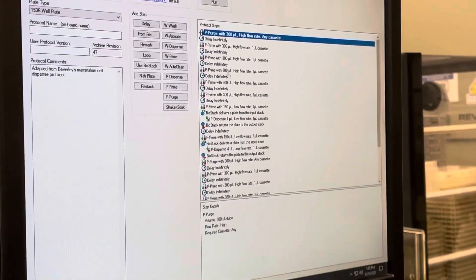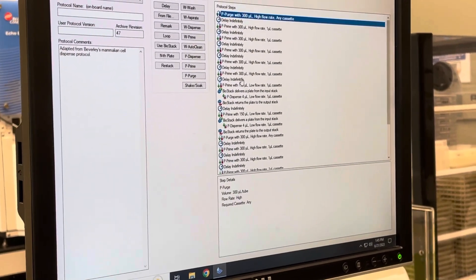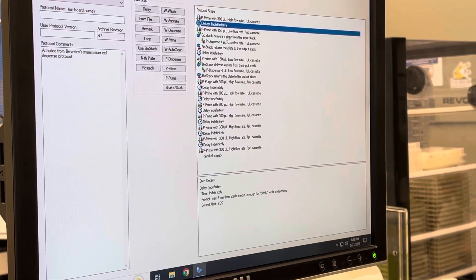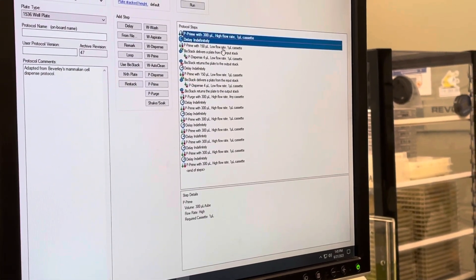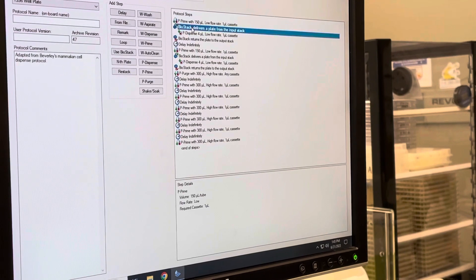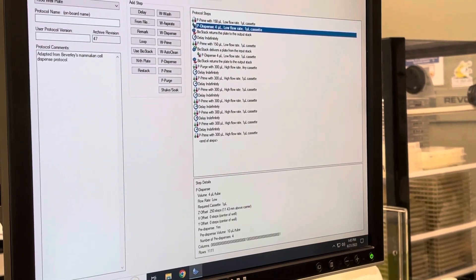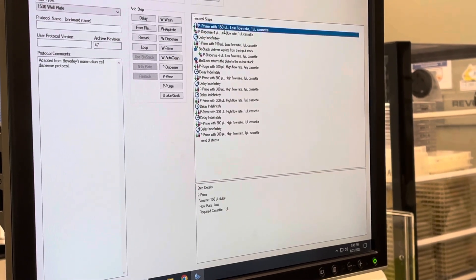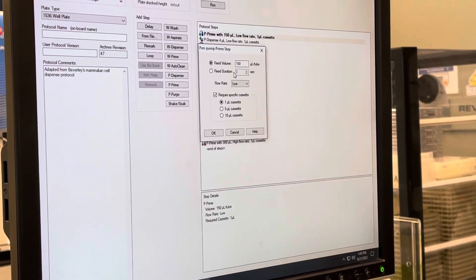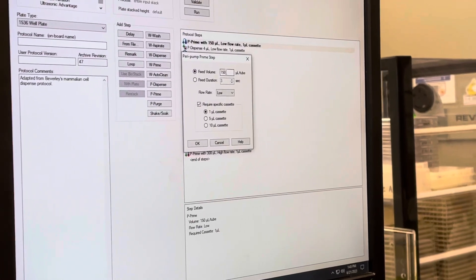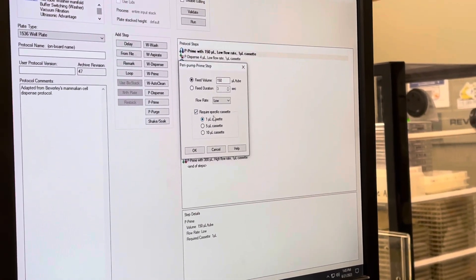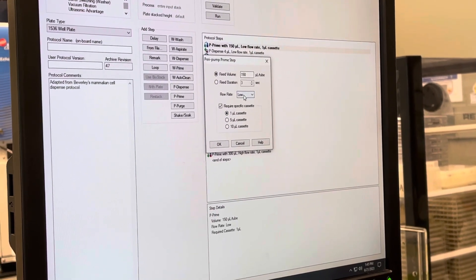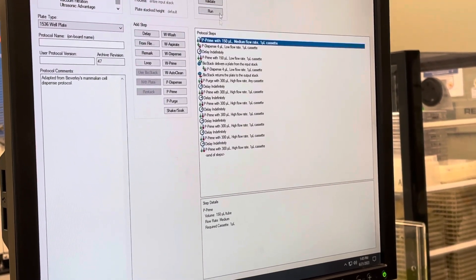We actually don't need all those primes, so I'm going to temporarily delete those. We just need one prime today. We're also not going to use the biostack — that's for if you have a stack of plates. We're just going to prime. You can double click on any step for more information. This is a 150 microliter fixed volume prime with the 1 microliter cassette. Let's try a medium flow rate and see how that goes.